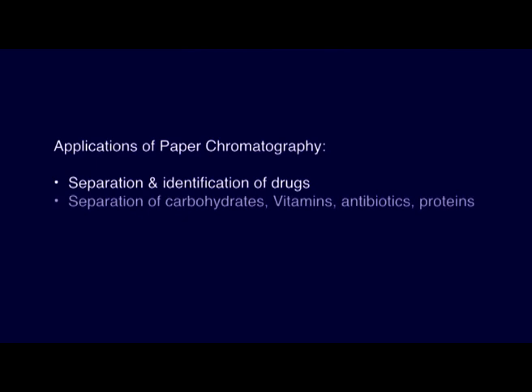Applications of paper chromatography mainly include the separation and identification of drugs, separation of carbohydrates, vitamins, antibiotics, proteins, etc., and also the identification of impurities present in the sample. The main advantage of paper chromatography is that the technique is very simple, rapid, inexpensive and has an excellent resolving power for the separation.